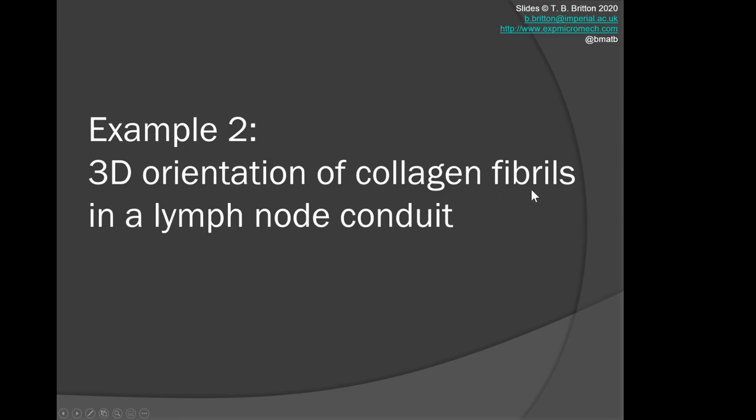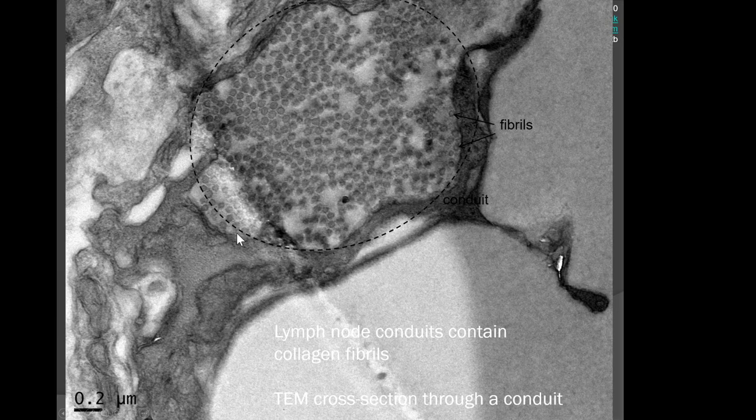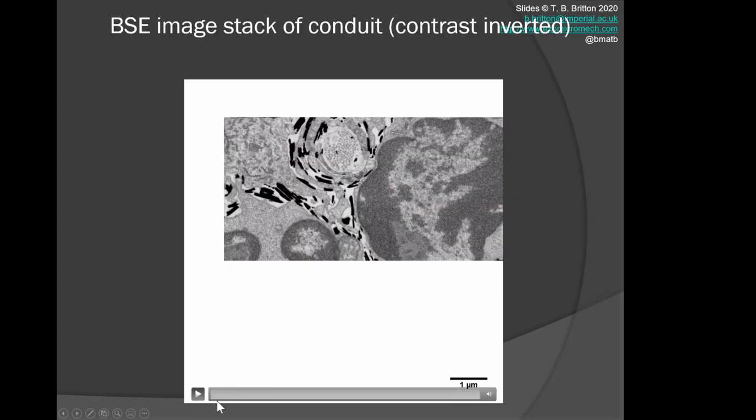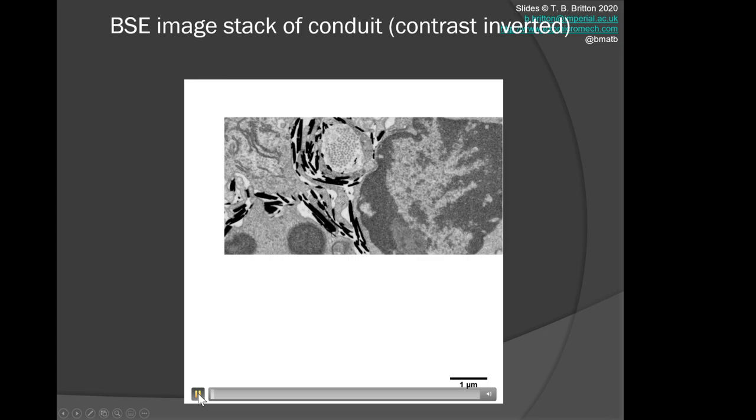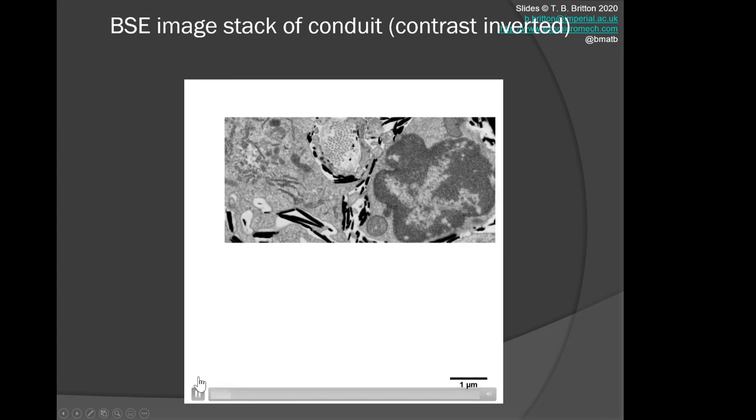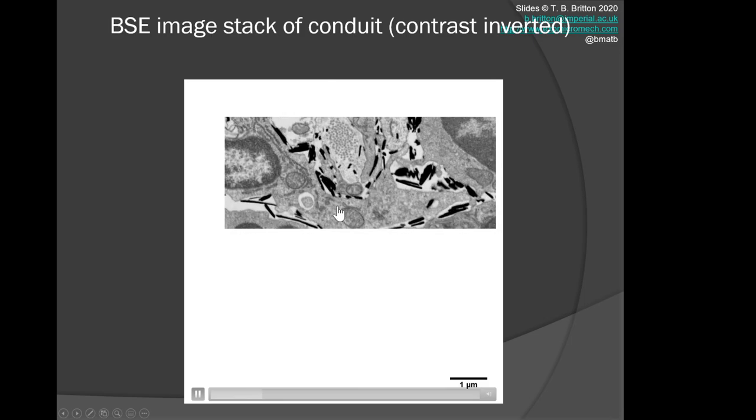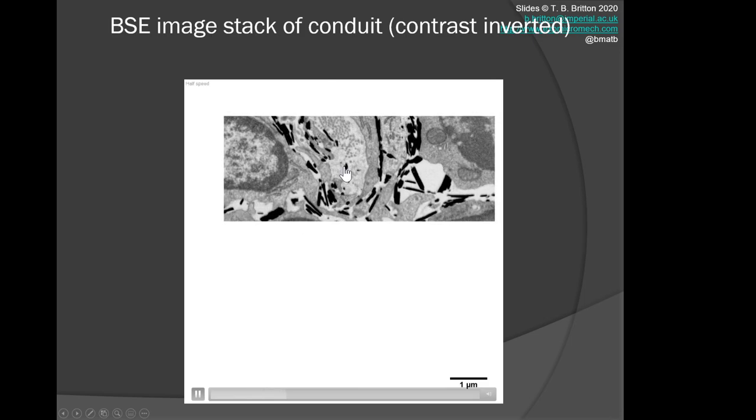A second example is looking at collagen fibrils in a lymph node. Here is an overview micrograph. In the TEM, these are the fibrils through the conduit. You've got collagen fibrils—here's the TEM cross-section. In the FIB, we've got that repeat slicing. These are the images as you slice through the stack. You can see those fibrils and these overall structures going in and out of view as you slice through the tomogram.